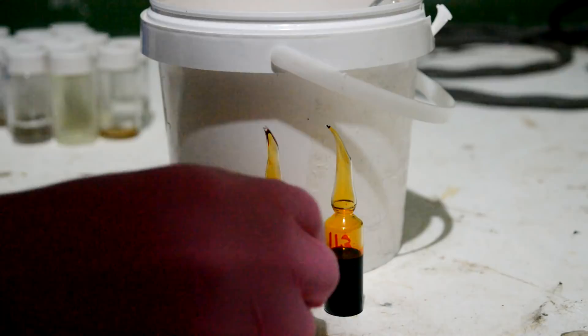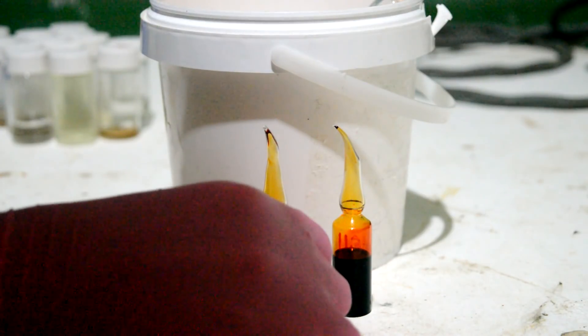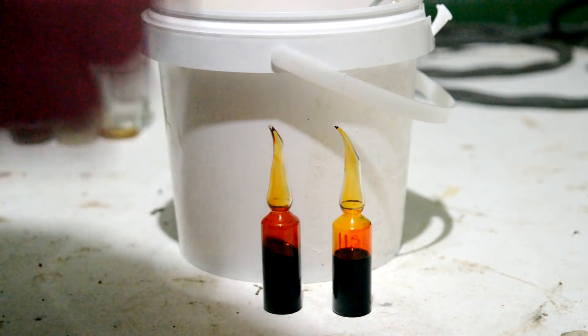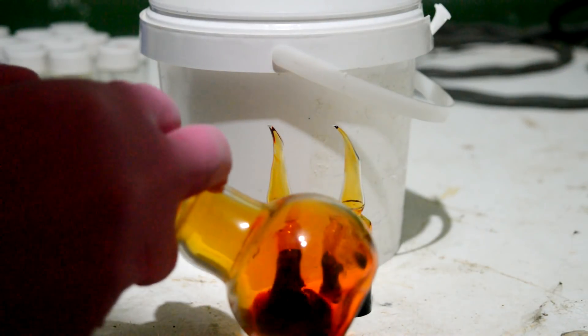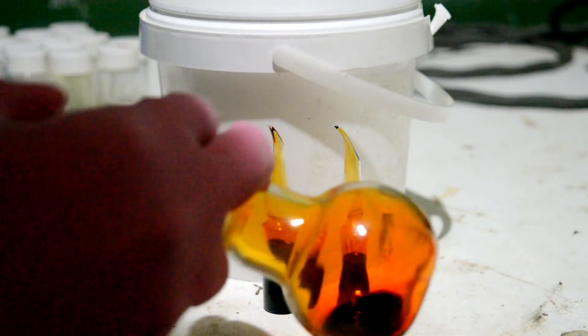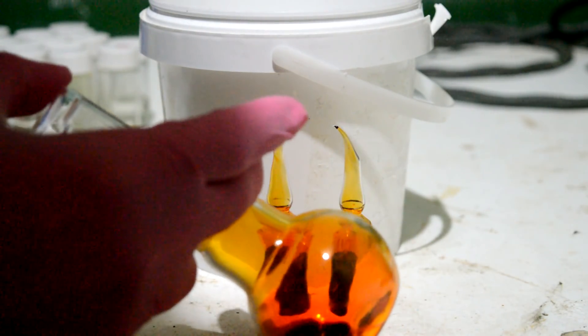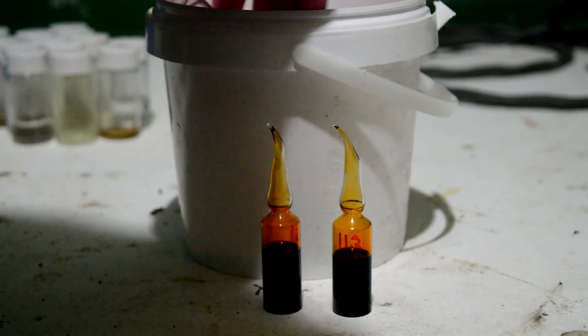All right, and these are our two final ampoules. So we've got 11.3 grams of bromine in here, and we've got 12.1 grams of bromine in here. Just a couple grams left in this flask, because I might be wanting to use it soon and I don't want to just put it in an ampoule and break it later. And it's seeming like it's being stored all right here in this ground glass joint container, at least kind of semi-temporarily.